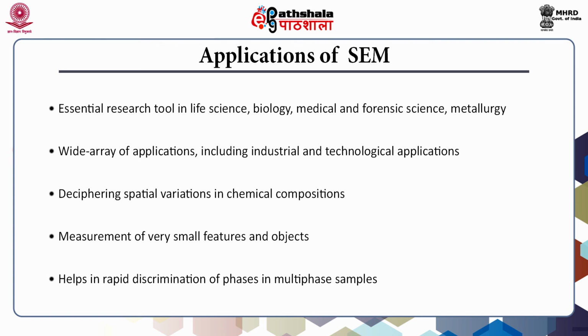Backscattered electron images can be used for rapid discrimination of phases in multi-phase samples. Wide array of applications including industrial and technological applications. It is an essential research tool in life science, biology, medical and forensic science and metallurgy area.